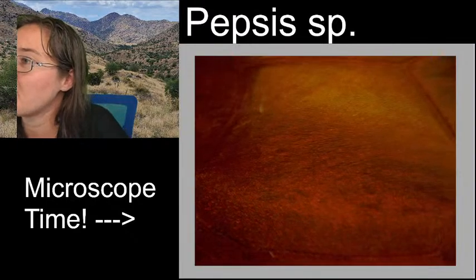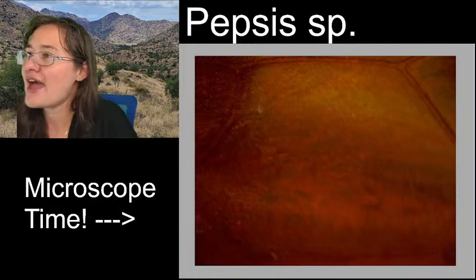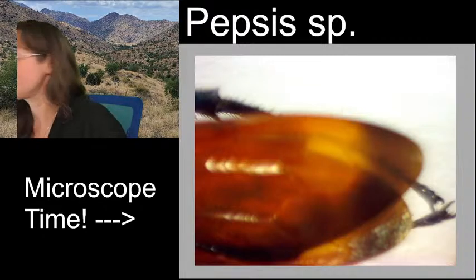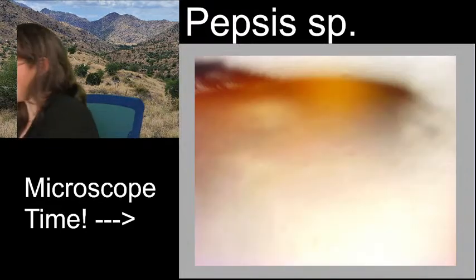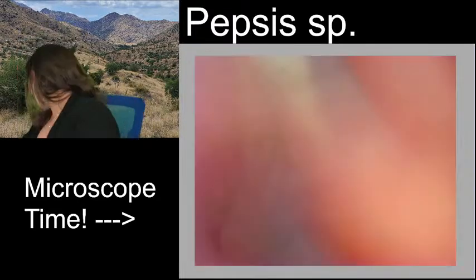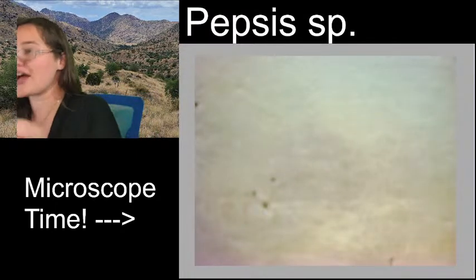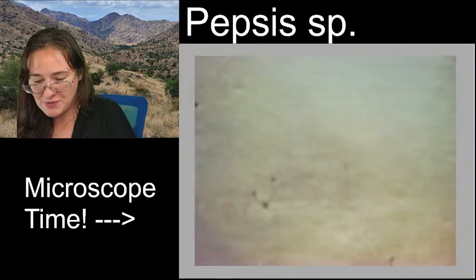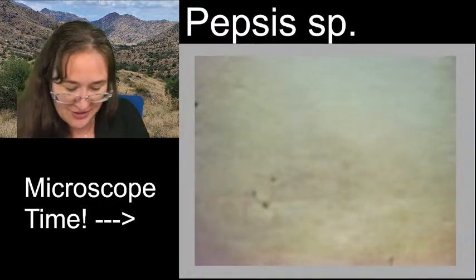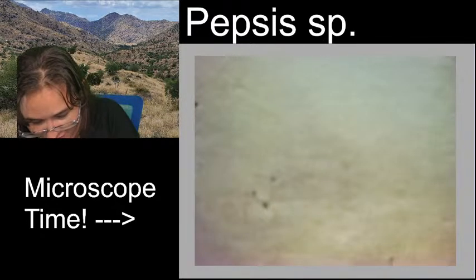Those little hairs in focus. I can see them, but they are so small that I don't know if I'm going to be able to get a really good image of them. And yes, a cicada is significantly smaller and significantly lighter than a tarantula. Oh, I know what I can use. I have all types of specialized trays that I use now under my microscope to make sure I don't hurt friends. I had one or two specimens get hurt when I first started doing this, so now we make sure that everything is good.